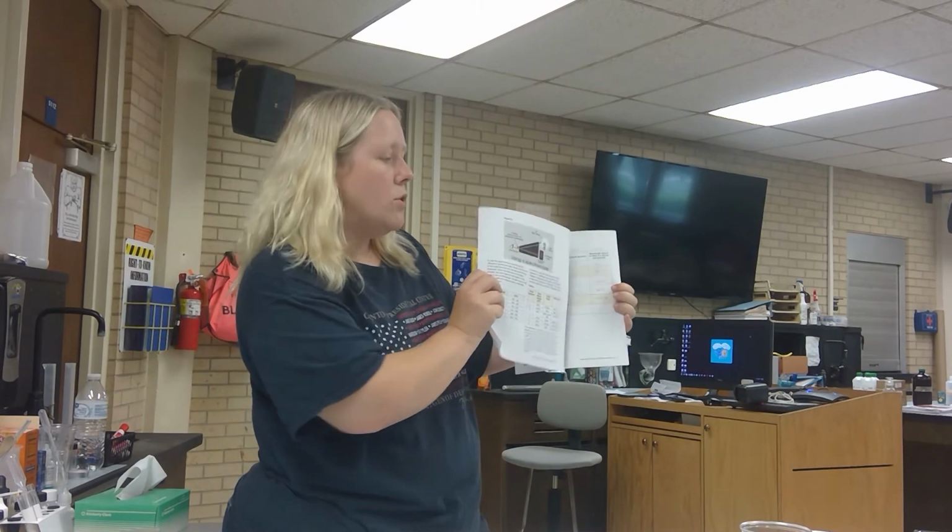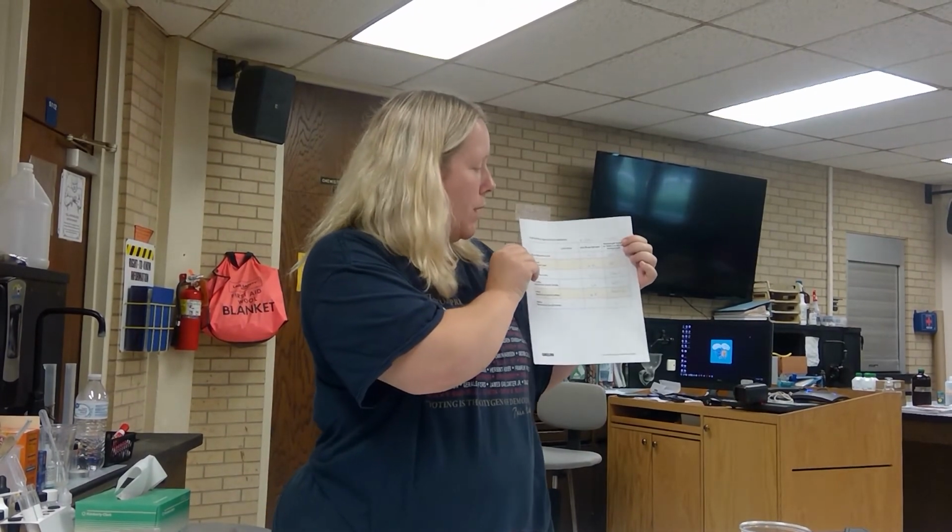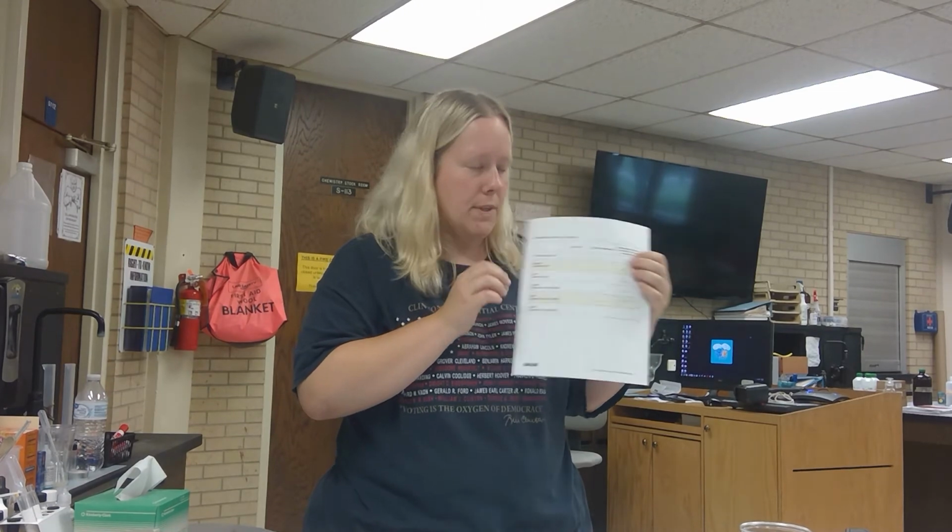So what that's telling you is that in your spectroscope, whenever you see a purple line, you should be looking for a wavelength somewhere in the 400 nanometer range. If it lines up perfectly with 4.4, that's the wavelength. If it's 4.5, the wavelength is going to be a little bit different, but you should still be in that vicinity.